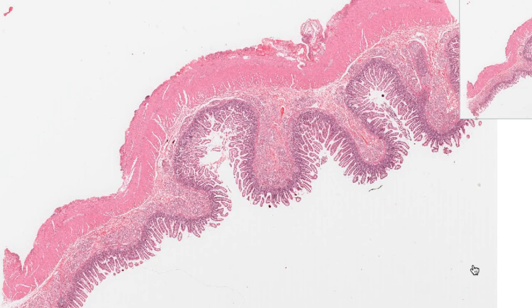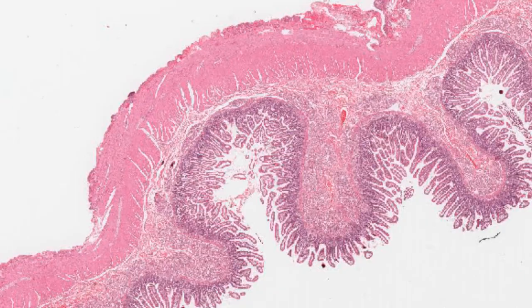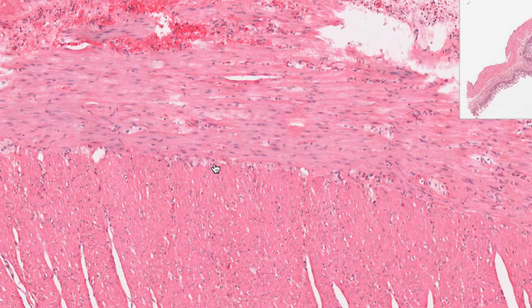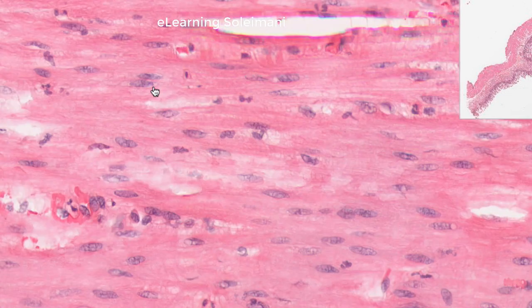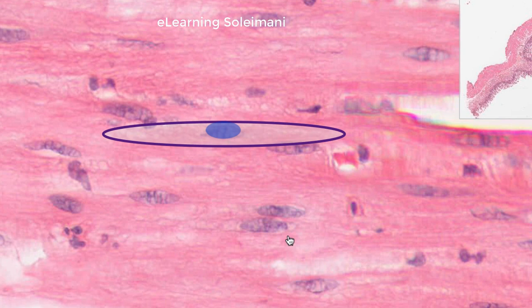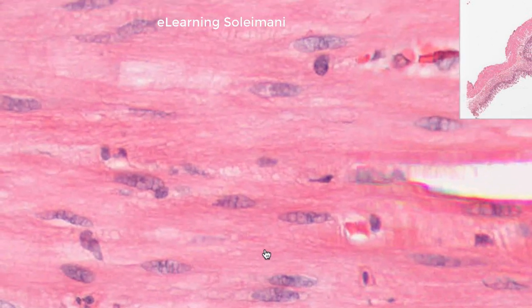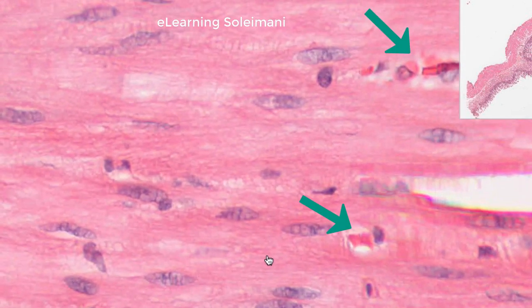In this slide we examine the smooth muscle, which is visible in both longitudinal and transverse sections. Smooth muscle cells are spindle-shaped and surrounded by loose connective tissue.